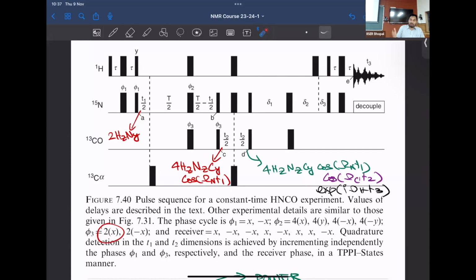So while you're able to get higher information by doing multidimensional NMR, adding more and more dimensions comes at multiple costs. One cost is the total measurement time, which increases as 2 power n significantly, where n is the number of dimensions. Secondly, you are also going to have multiple INEPT or polarization coherence transfers that have to be implemented.